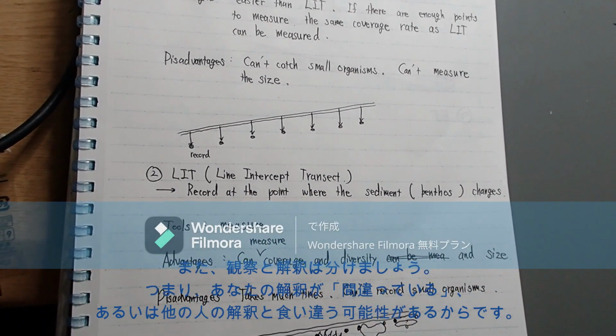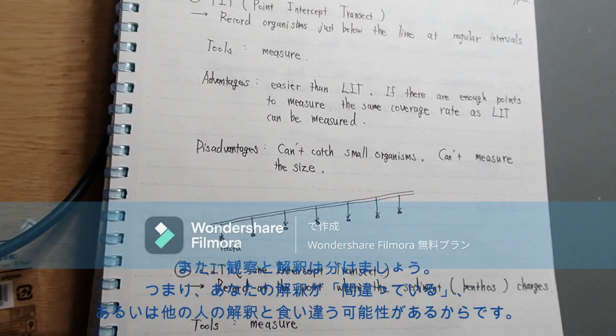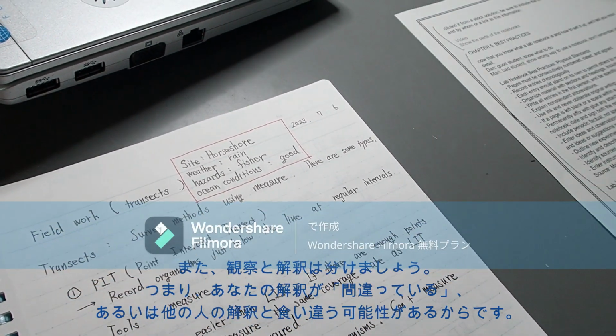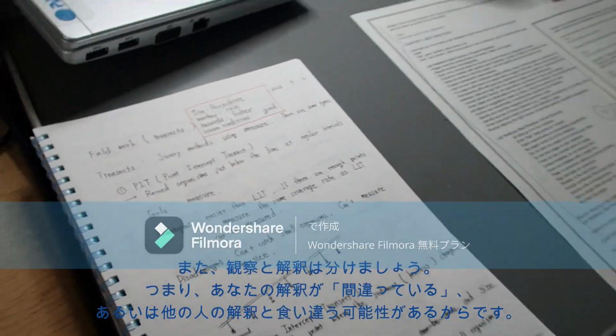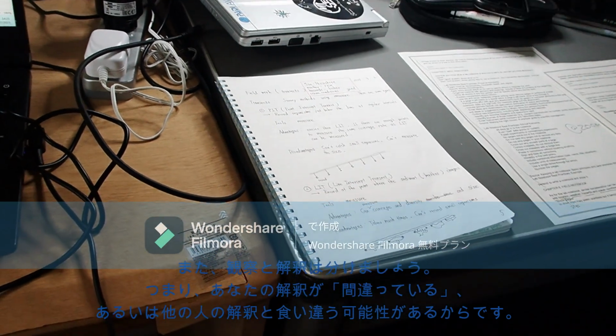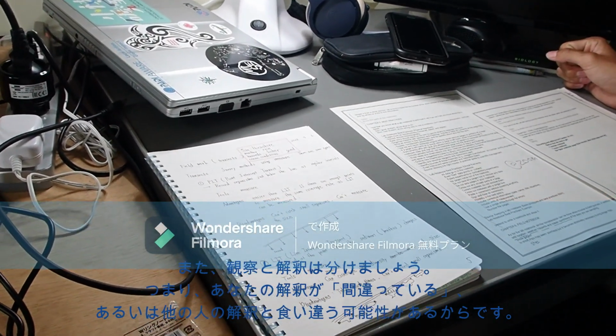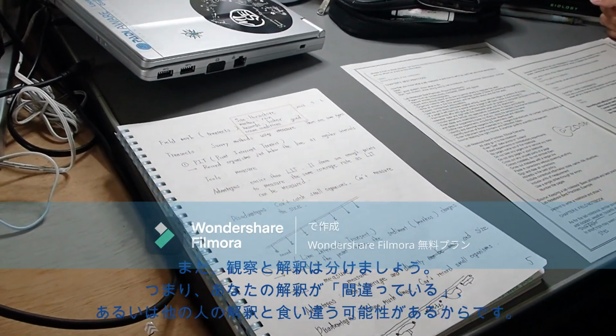Separate your observations and interpretations. These should be kept separate for a very practical reason, namely that your interpretation could be wrong or disagree with someone else's.